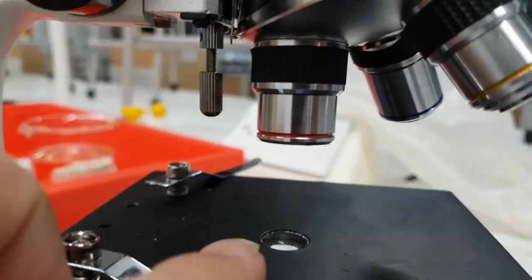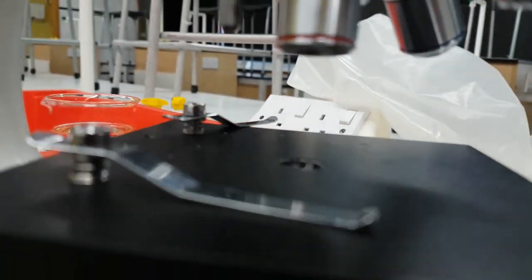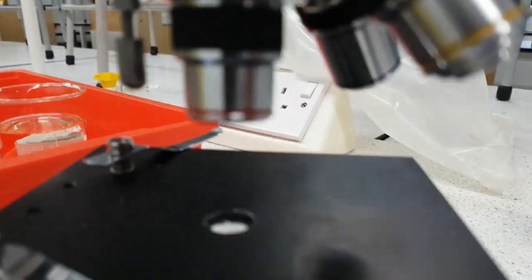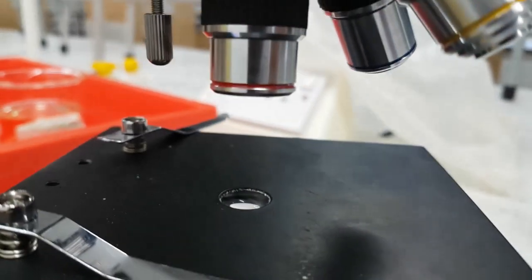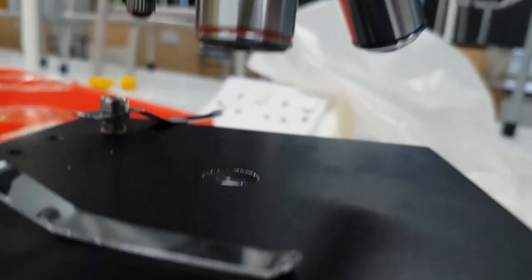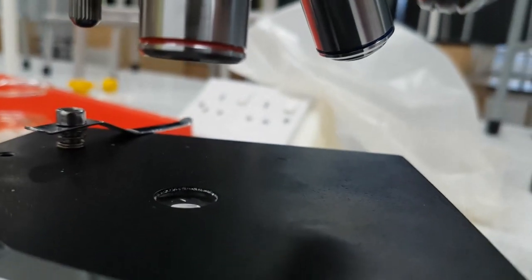And the objective lenses are over here. So basically the reflected light is going to go through the slide which will be placed there and then magnified using the objective lens and that's the idea.